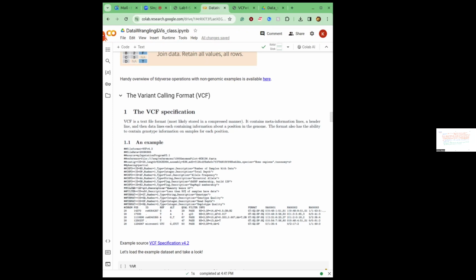So I'm asking, what is an indel? Yeah, it's insertion or deletion. So there can be a deletion, there can also be an insertion, right? That's why it's an indel, in and del. So if you compare it with the reference genome, if your alternative, in your sample, is longer, then this is an insertion, right? And if it's shorter, then this is a deletion.